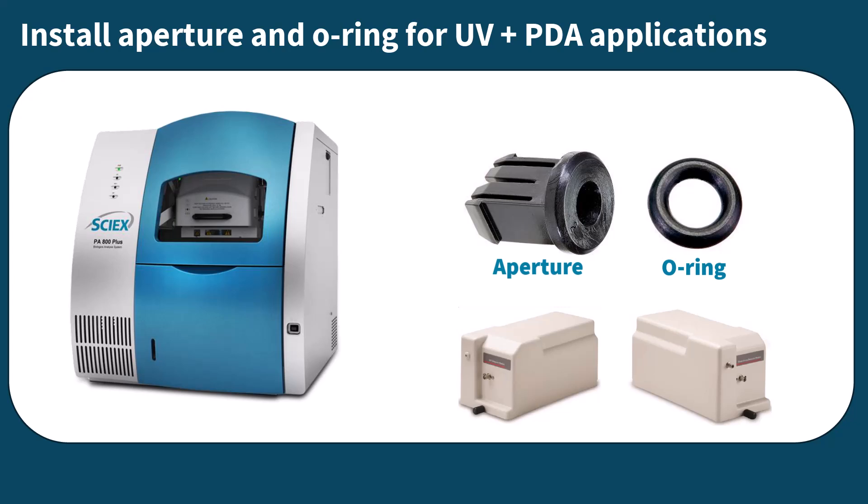In this video, we'll show you how to install the cartridge aperture and o-ring used in PDA or UV applications. Make sure you are installing the correct UV or PDA aperture size for your experiment's application. Aperture size is indicated by the number 2 or 8 on the back of the aperture. Your application guide will indicate which of these aperture sizes to use.